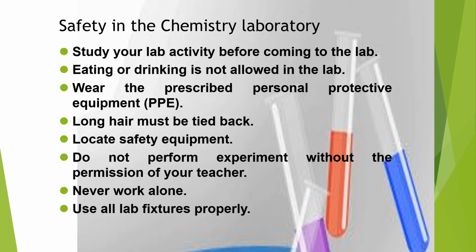Wear the prescribed personal protective equipment. Long hair must be tied back. Locate safety equipment. Do not perform experiments without the permission of your teacher. You are not allowed to work in the laboratory alone. Never work alone. And use all lab fixtures properly. What are these fixtures? The water outlet, electrical outlet, gas outlet.